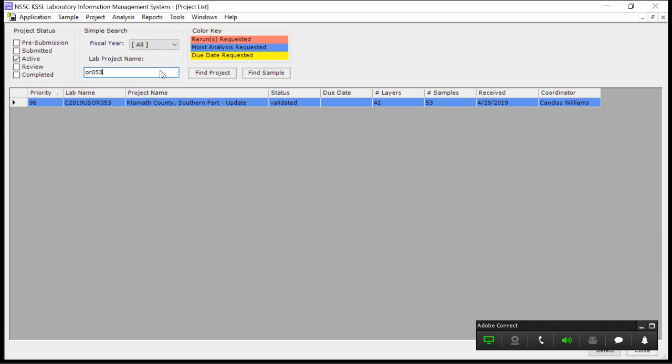Then, as time goes by, you can go into LIMS and check that project and check progress on it, and also as a backup, because like Scarlett said, the priority is just an indicator. So you can kind of ride herd on those types of projects and communicate with Scarlett or somebody in the lab if it doesn't seem like it's going to work by that time, and to make sure that gets done.